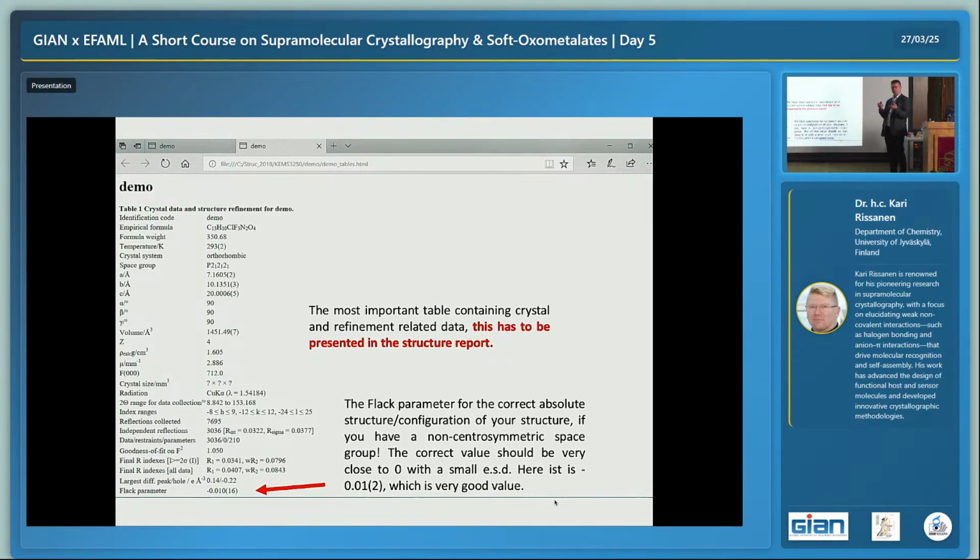But if you dissolve this and put it in the NMR tube, you don't see the differences, because in NMR the enantiomers are the same. You can't see the difference. But in X-ray diffraction, if it's a pure enantiomer, then there's a difference. And this space group here, P 21 21 21, is a so-called chiral space group, and there is no mirror image.